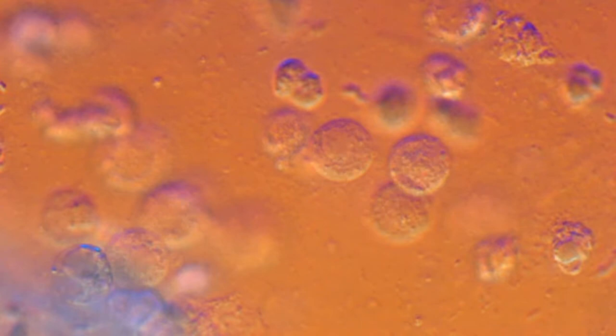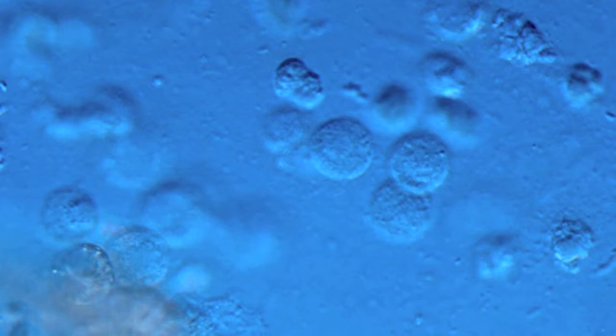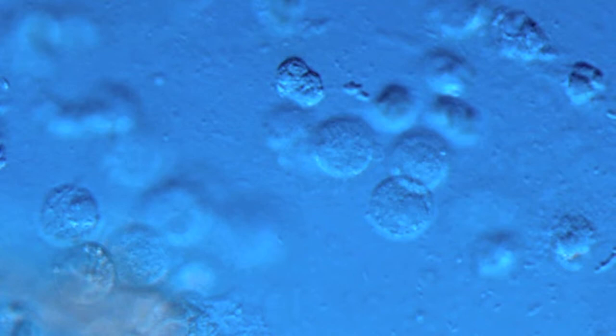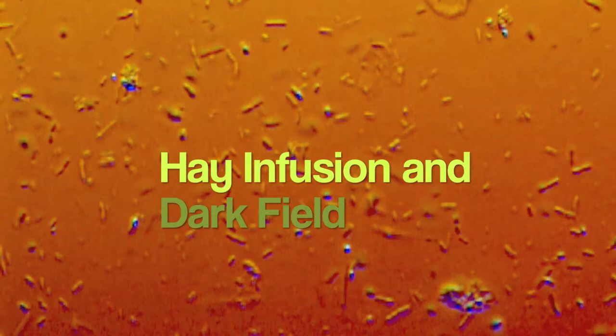Yes, it is snot. That's what you are looking at, and that's how we collect snot — from a snotty person. It's full of epithelial cells from the nose and bacteria. And these white cells are the fabulous cells from your immune system that are busy trying to ward off the antigens and the bacteria that have entered your nose. Look at the high level of cellular activity inside these immune cells. They are locked and loaded and ready for action to help you get well, even though it takes a few days. White cells are cool.